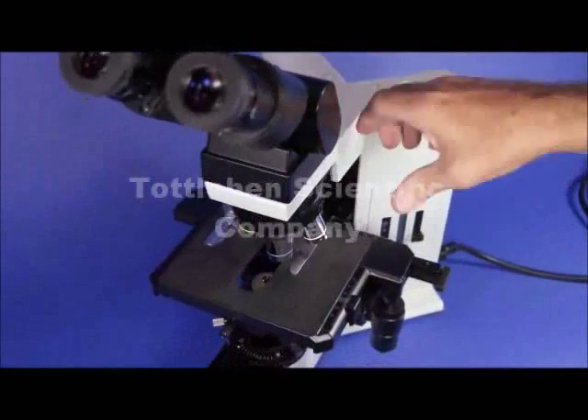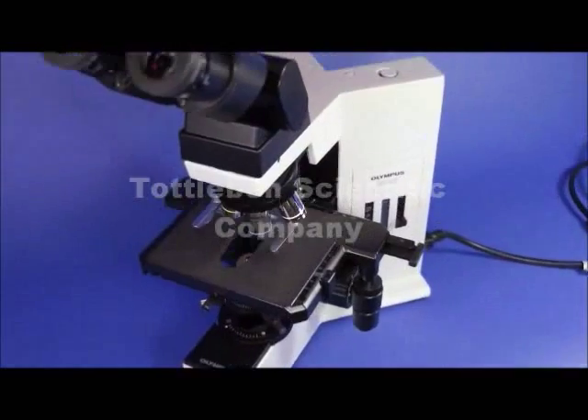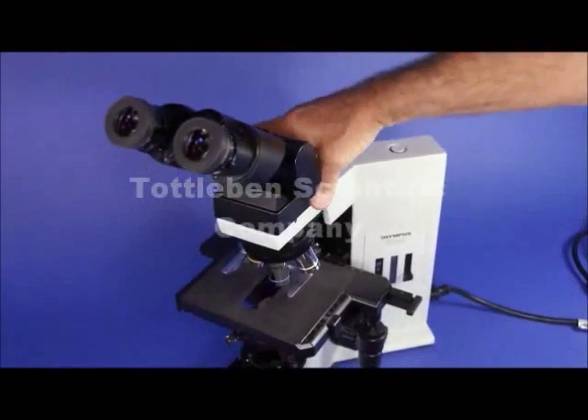Working our way down, the head can be loosened and swiveled all the way around. So if you want to do some teaching and turn the head around, you can do that.